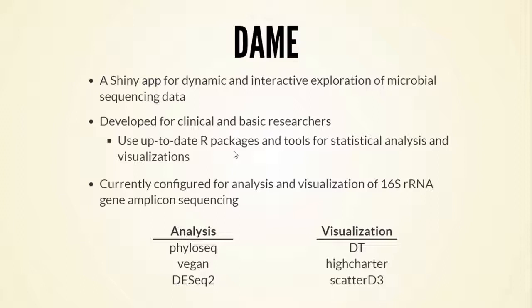So we really wanted to build a Shiny app that would give them the flexibility to dynamically select their experimental groups that they are analyzing, and also provide the ability to run the different phylo taxonomic levels in parallel in an easy-to-use and user-friendly app.